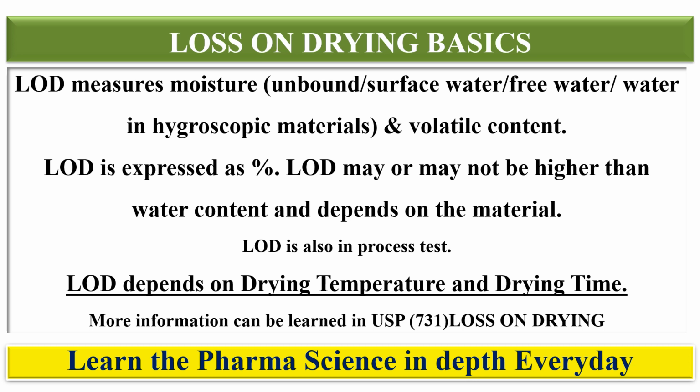So you should not consider both the tests as the same, and do not expect the same values for water content and the LOD, because both these tests are different, their mechanism is different, their principle is different, and whatever testing of the material we are doing is different. So LOD determines loss on drying, and water content determines the total water content. Whatever water is present, that is determined by the water content testing.